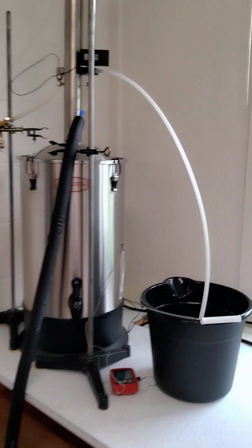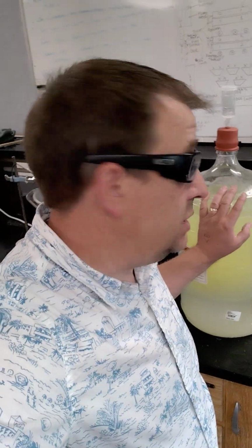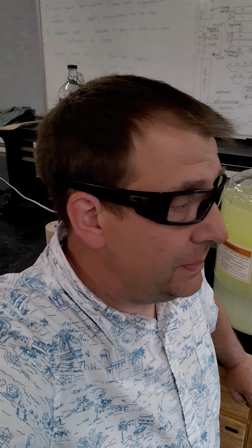Right now we have been doing a lot of practice with this distillation unit, so we're using it to distill all of our own distilled water. In a lab setting, there are a lot of chemistry experiments where you just don't want the contaminants in there. Part of it is going to be the fermentation. We are going to start with distilled water. The other thing is, in this area, we've got a lot of calcium in our water, and we don't want to get that into our equipment. So we are going to use distilled water there.